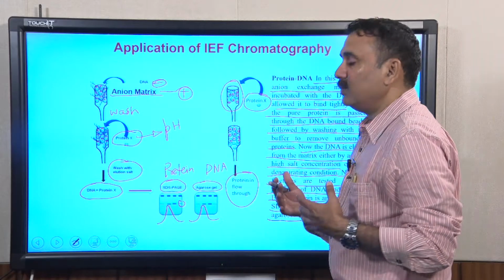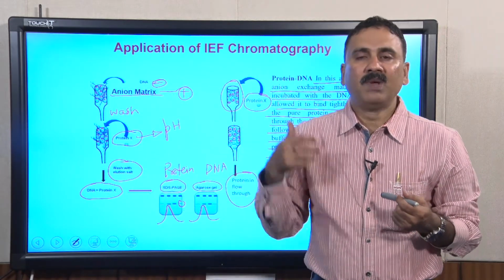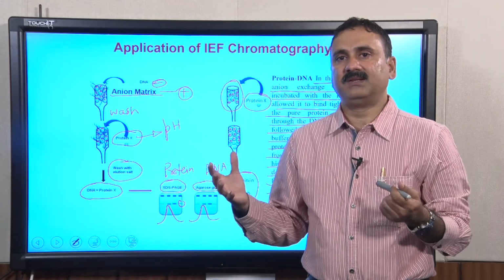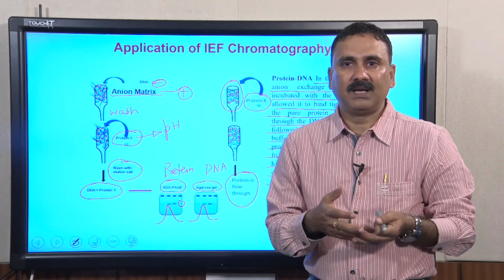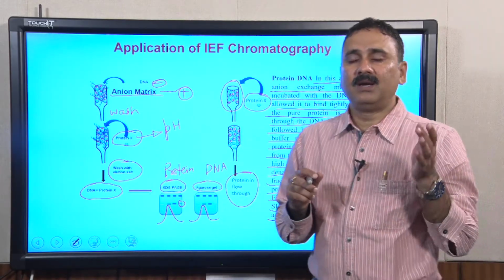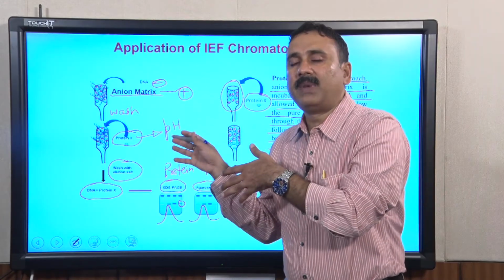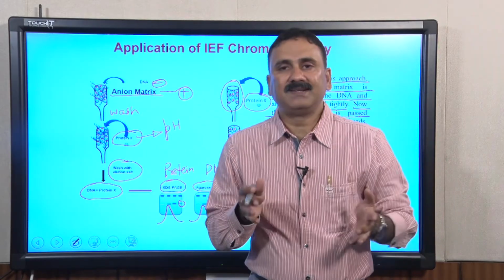When you do this experiment, it will say that protein X is interacting with the DNA, but to verify this you can do control experiments, such as adding the protein and its mutants, or performing similar experiments at a different pH, because you know that DNA and proteins interact through electrostatic interaction. So, if you change the pH, the pattern may vary, and that is how you can study the DNA and protein interaction.